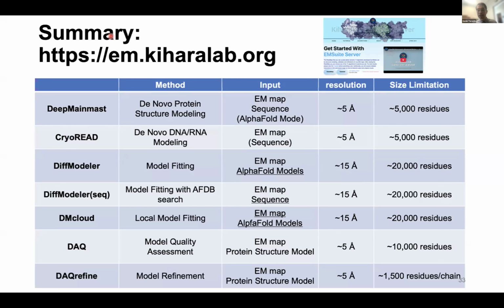Okay. So the size limitation is that if we use RoseTTAFold or AlphaFold, it has a size limitation from the GPU memory size. This is the main reason. But if you have 80 GB of memory, then the user can extend the size limitations.